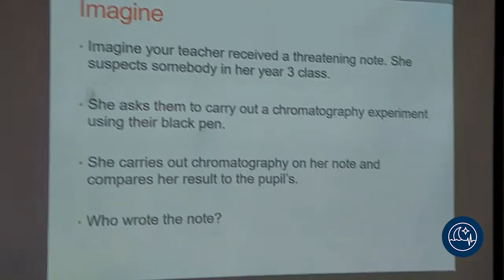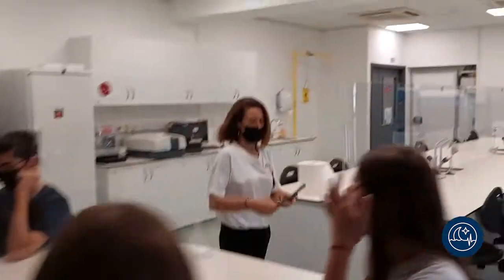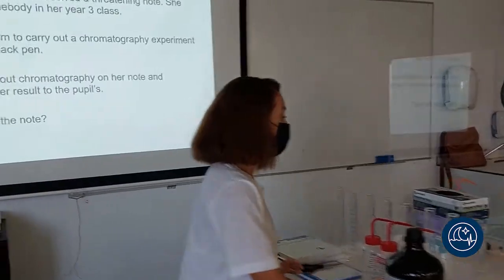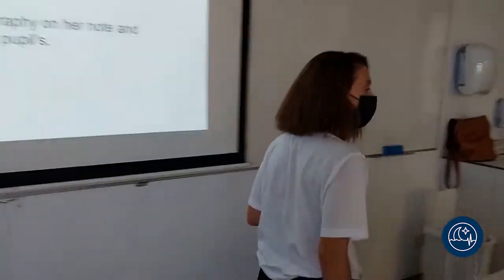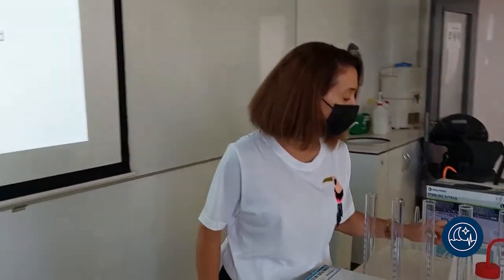Yeah. So what you're going to do, guys, you're each going to get markers. So one of you wrote a very threatening letter to your teacher. So let's see who it is. I actually took some of the ink found in the threatening letter. You don't write a threatening letter, pretend you did. Where did I put the colour?